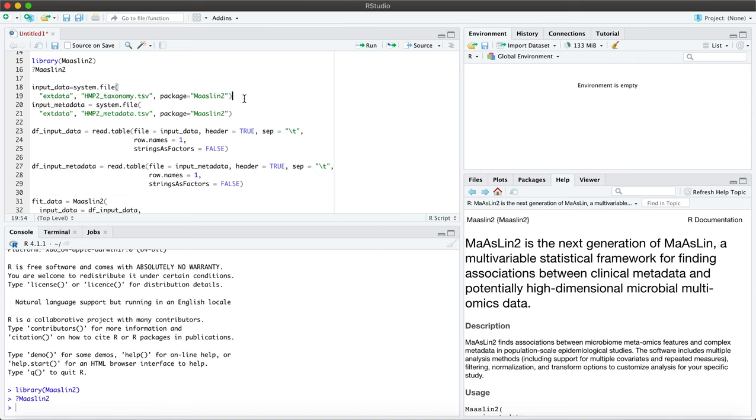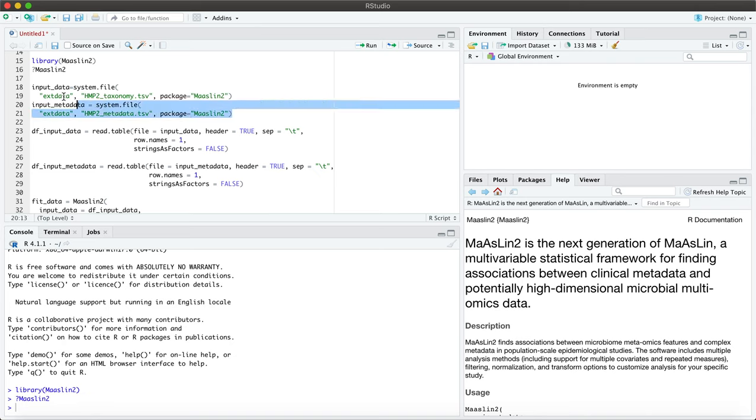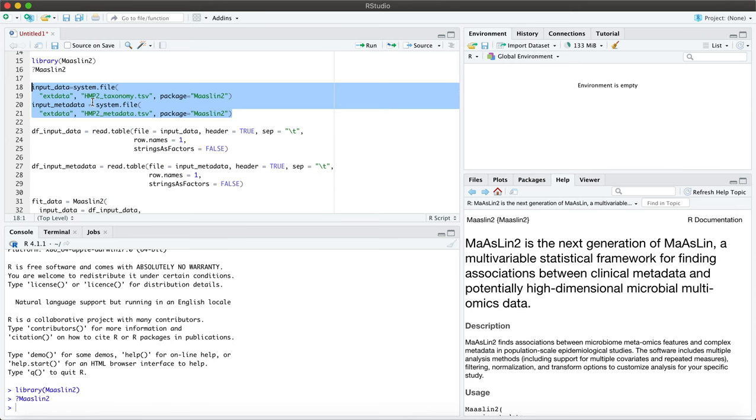All right, so for this tutorial we will be using two data sets: a data file with bacterial taxonomy and a metadata with clinical data. And these are both provided within the package and can be retrieved as follows. You can also find these data sets if you look into the human microbiome project online.